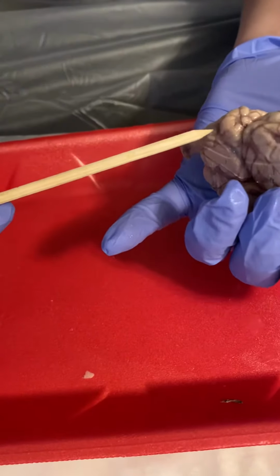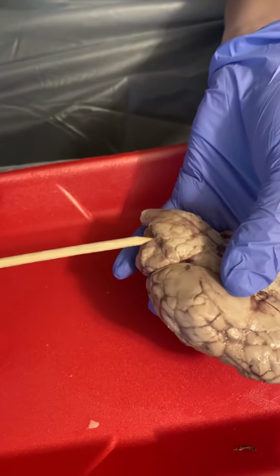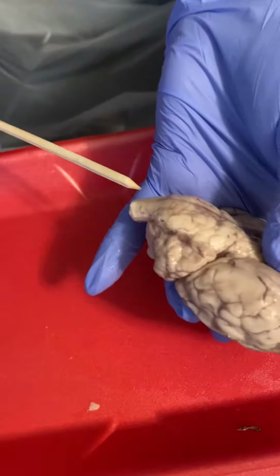Here, you have your cerebellum. Your pons would be within here, and they would go to your medulla oblongata. This is your spinal cord.